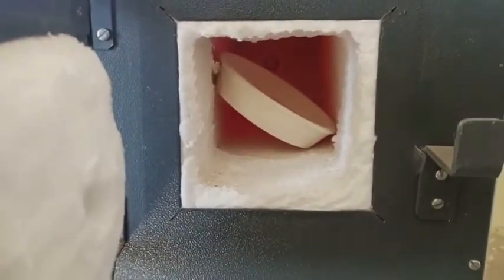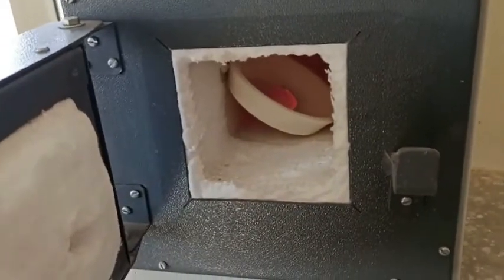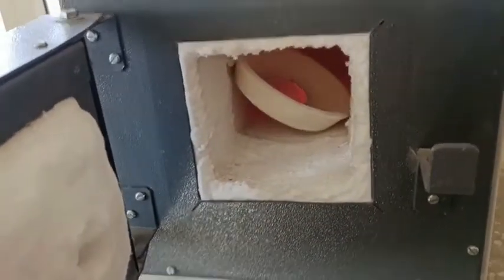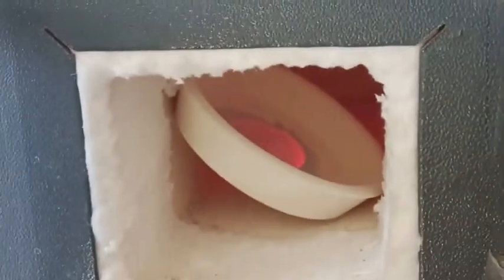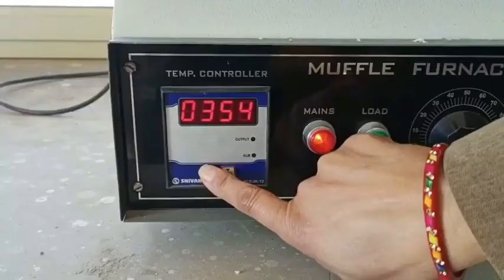Here you can see red hot — my crucible is not fitted horizontally, so I make some arrangement. You can see this is made up of ceramic and it is also red hot. Since I just want to show you how it looks at high temperature, that is why I opened the chamber.